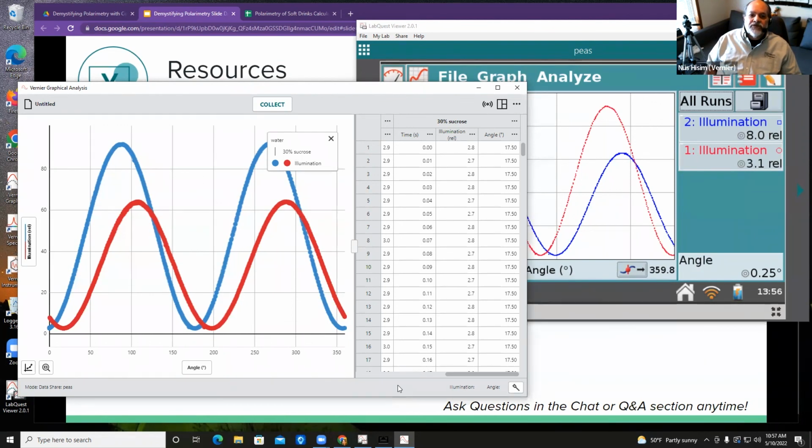But if you happen to own that hardware already, it is a way to get that data into a newer piece of software, in this case Graphical Analysis. We have some schools that have a lot of our equipment but want to move forward, and ask how they can integrate what they already have with what they want to buy. This is what Melissa demonstrated.